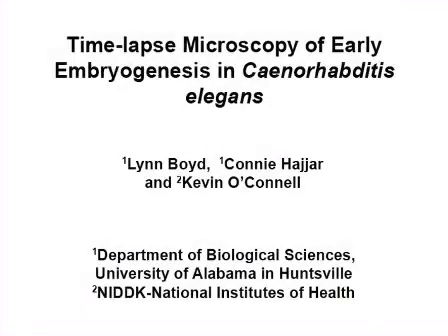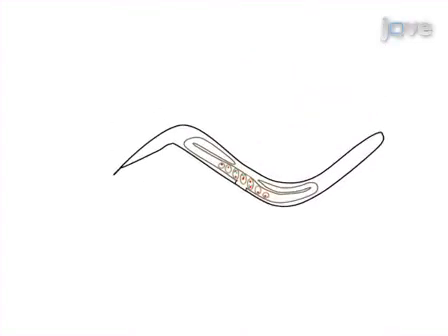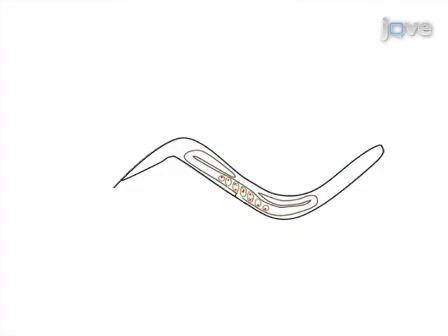The overall goal of the following experiment is to record subcellular events during early embryogenesis in Caenorhabditis elegans. This is achieved by using transgenic strains with multiple fluorescently labeled proteins that allow the visualization of DNA as well as subsets of vesicles in the early embryo.